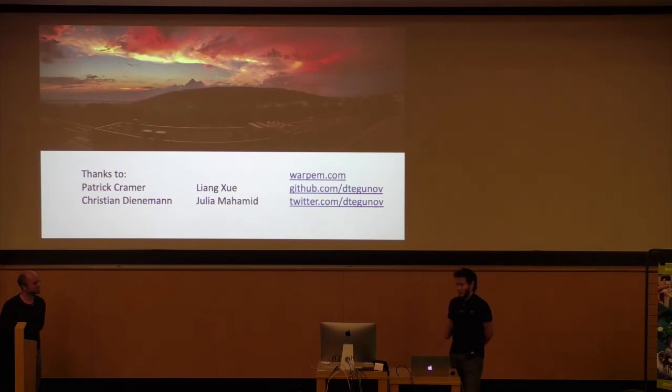Well, since they were collected in Heidelberg by the Dutch superstar drummer, who also moonlights as the facility manager there, I would assume that those were Hagen schemes. Yes. I'm very much waiting on the EMBL folks to release their raw data for this comparative study that they did recently for the different tilt series acquisition schemes. But yeah, dose-symmetric is the way to go right now.